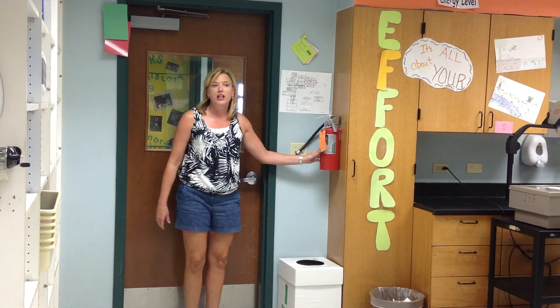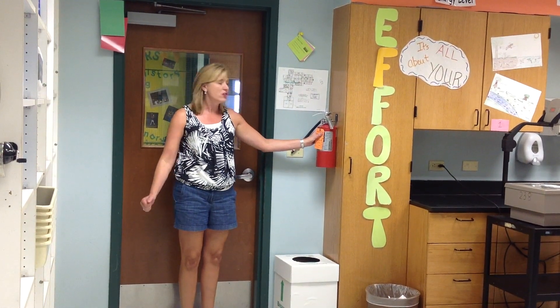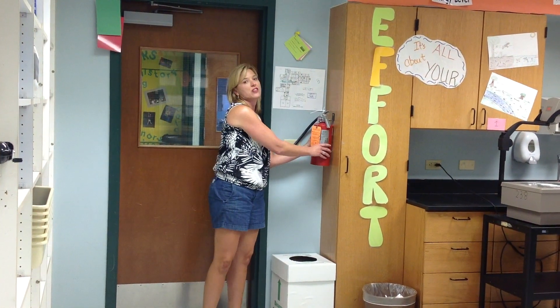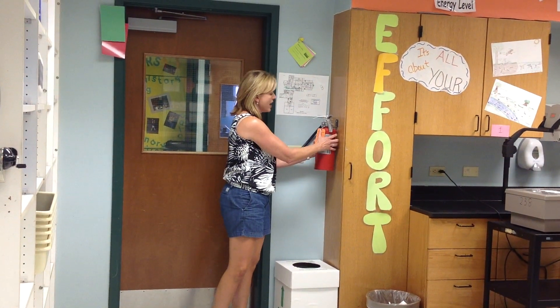The first thing you have whenever you walk into the classroom is a fire extinguisher. We will be working with flames this year, so the fire extinguisher is not a toy. You would be able to pull the pin and aim the stream at the base of the fire.